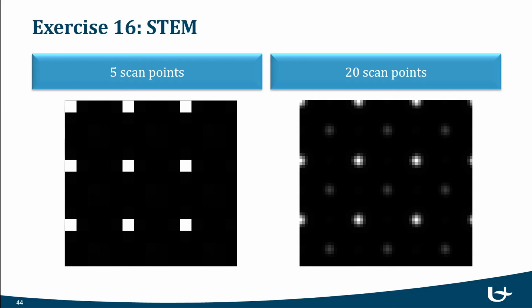The first thing we notice in this exercise is that the computational time increases by a large factor compared with the previous simulations. This is due to the fact we have to repeat the full multislice process including phonons for each scanning point. The simulation time will be proportional to the number of scanning points embedded on the scanning area. Keep in mind you have to use enough sampling points in order to capture the relevant information in our experiment.